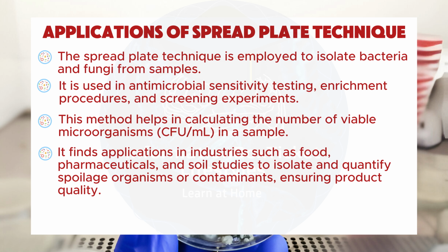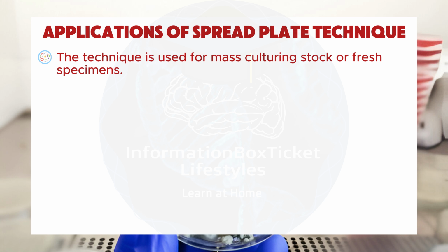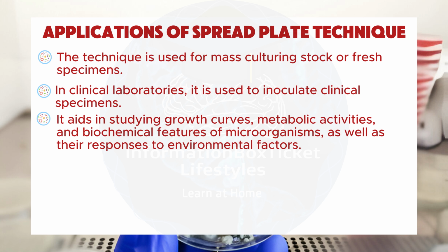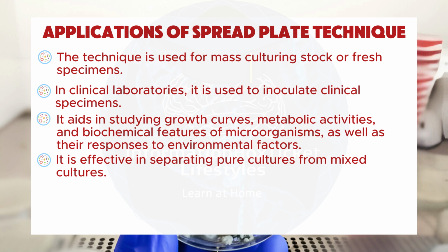It finds applications in industries such as food, pharmaceuticals, and soil studies to isolate and quantify spoilage organisms or contaminants, ensuring product quality. The technique is used for mass culturing stock or fresh specimens. In clinical laboratories, it is used to inoculate clinical specimens. It aids in studying growth curves, metabolic activities, and biochemical features of microorganisms, as well as their responses to environmental factors. It is effective in separating pure cultures from mixed cultures.